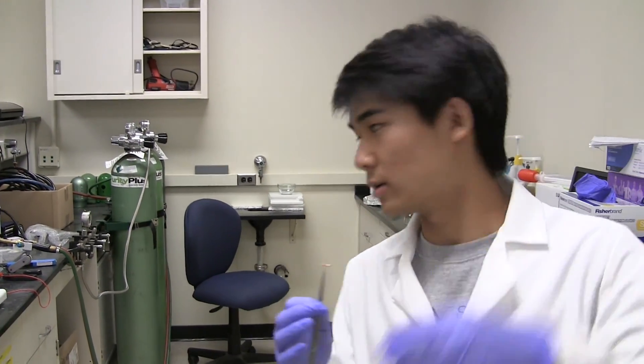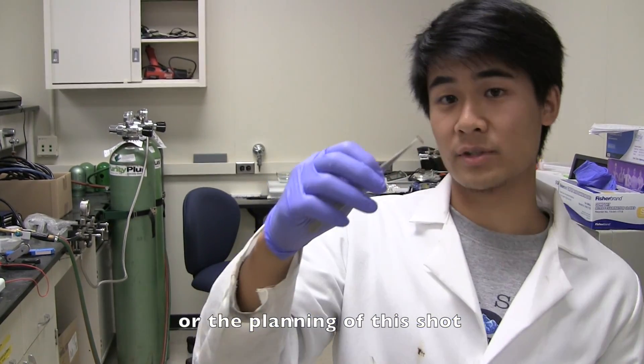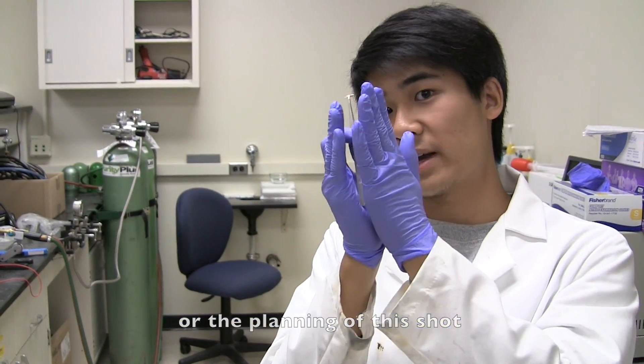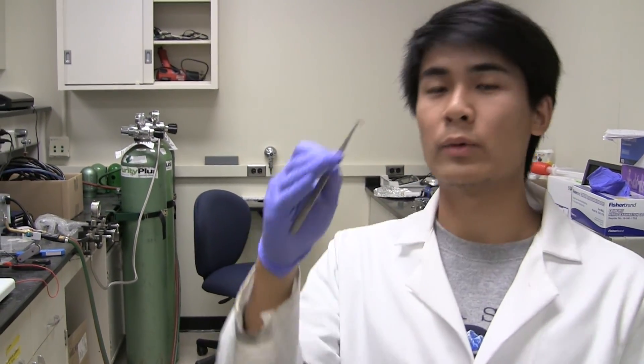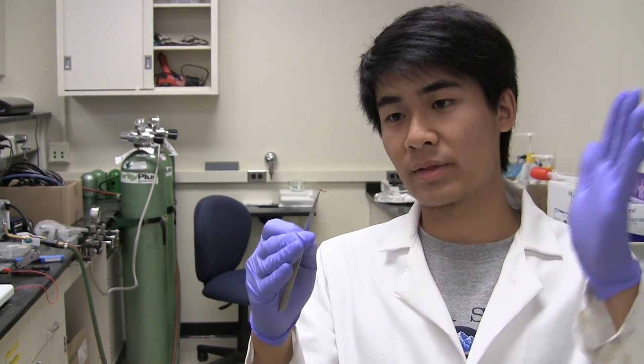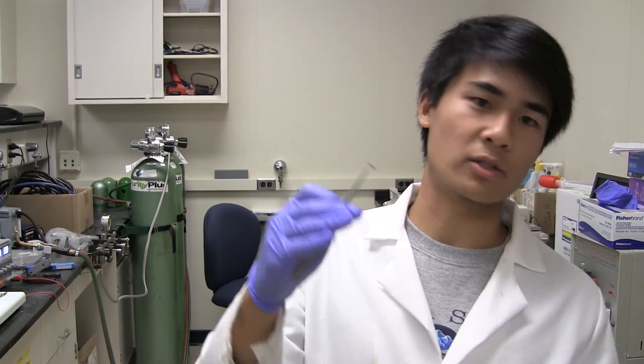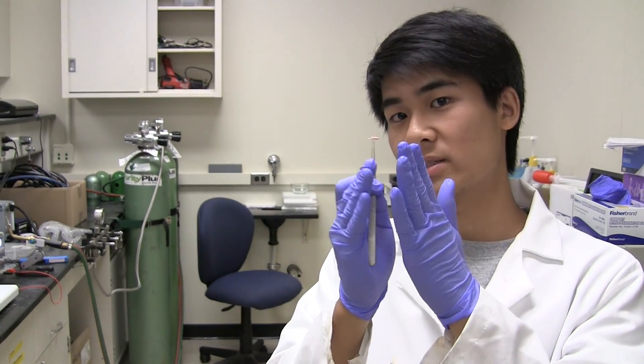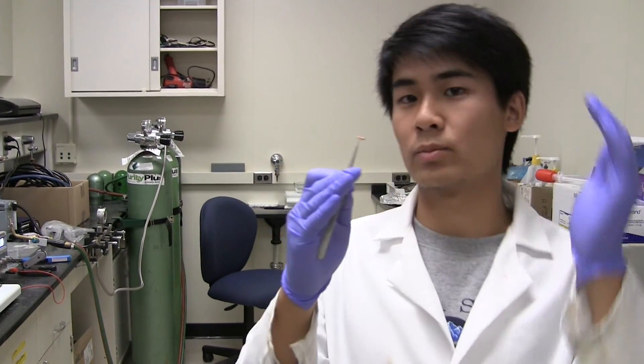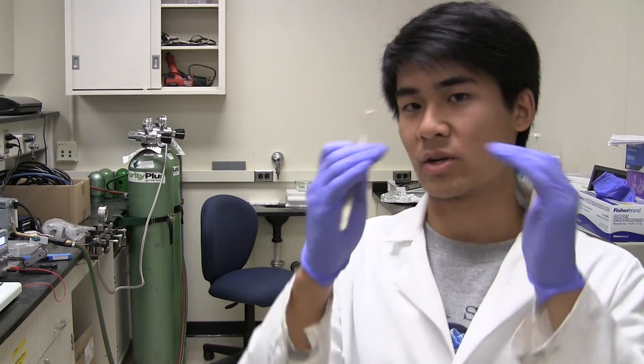So what I have is I have a setup where I use some acid and I create an electric current to tear away layers and layers of this metal so that I can get that really fine needle shape that I'm eventually going to put into the atom probe. We want this really fine shape because when we run that electric field through it, we don't want it to be too fat or too wide so that it causes the specimen to break. We want that really fine shape so that eventually the shape will turn out to be round and nice curve.